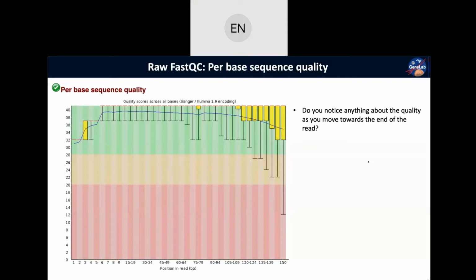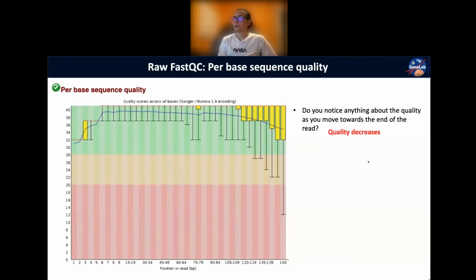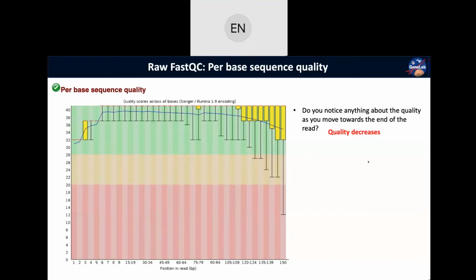Why do you think that is? Well, a lot of enzymes do that. Yeah, that's a feature of enzymes. This isn't exactly the same, but I don't know if it's enzymatic, but there's more diversity at the 3' end of a sequence than there is at the 5', and the thinking is that's enzymes not being able to function as precisely as they go down the sequence. But I don't know if that's the reason here.